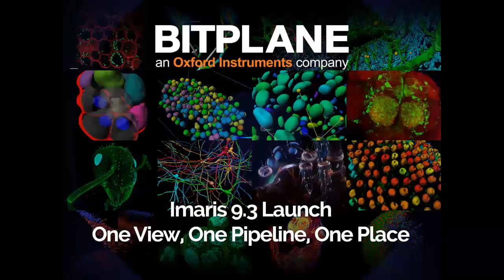I've been calling it one view, one pipeline, and one place. The main objective that we're trying to get across is that you can do many more things within Imaris now, and it can be your one place for carrying out an entire workflow. I'll go through the different aspects of that, talk to you about what's changed, and give you a little bit of an idea of how things work in the new version as well.